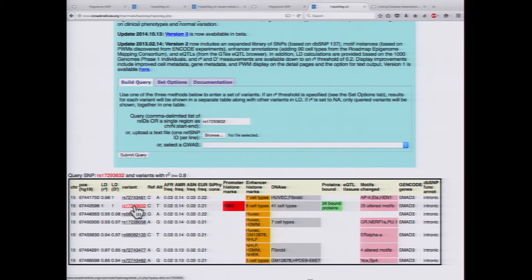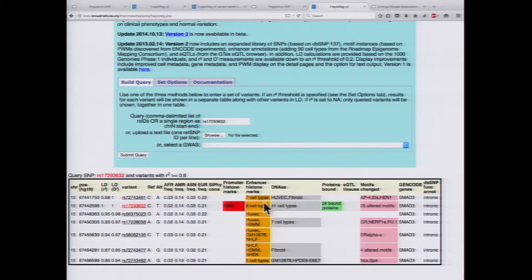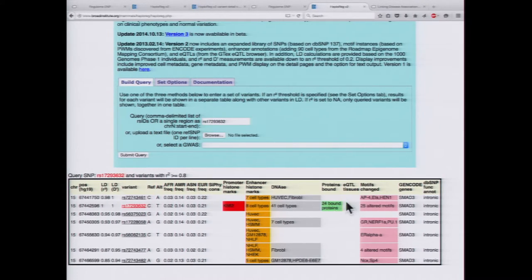It actually looks like our queried variant would most likely be the causal variant in this case, because it has enhancer marks in eight different cell types, DNase in 41 different cell types, and many bound proteins in different cell types.